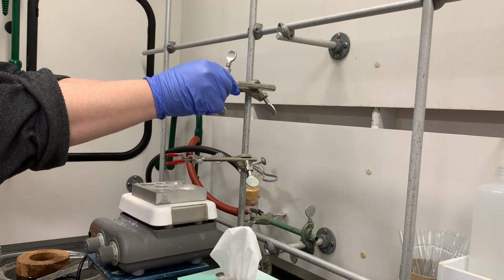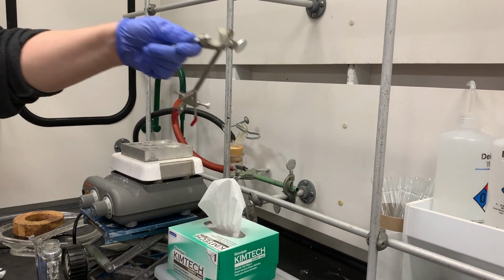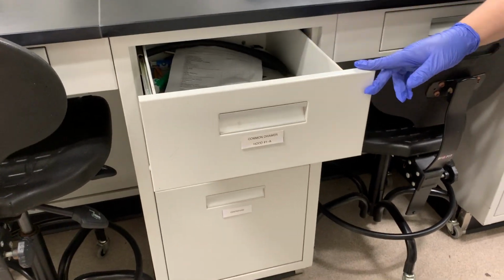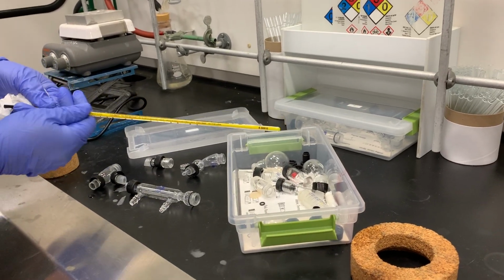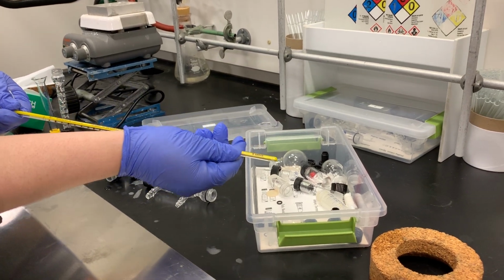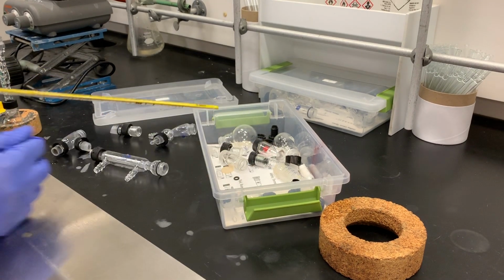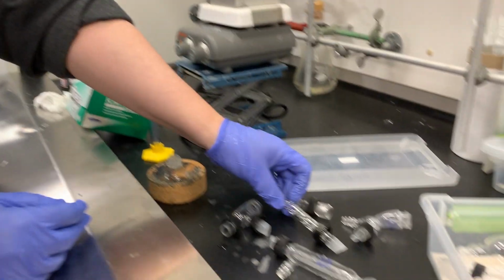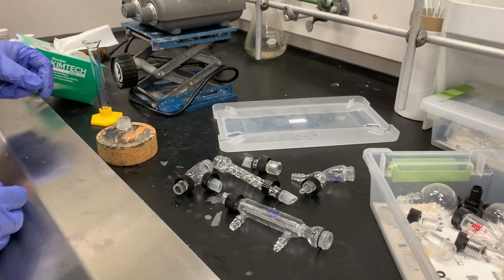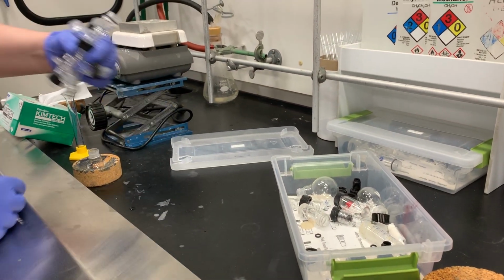And so now we're just disconnecting the clamps from the back of the hood and putting them away in our common drawer, taking the O-ring off the thermometer. It's a little stuck there, but it'll come off. Now we're going to put that into our microscale kit, put the thermometer away. Then we take all of our pieces, put them down. We're going to wash them the same way as we did with the simple distillation.